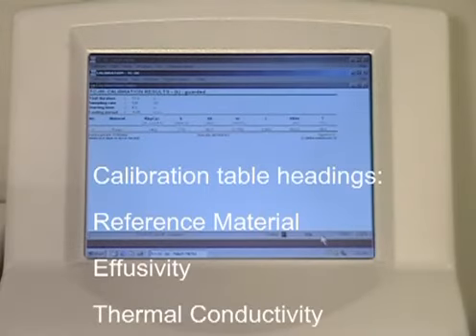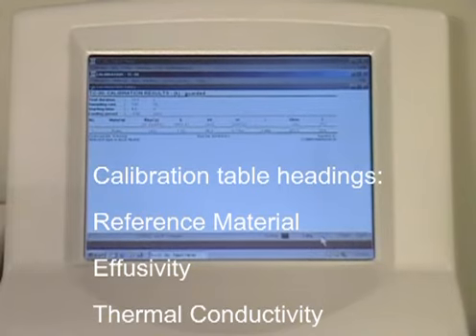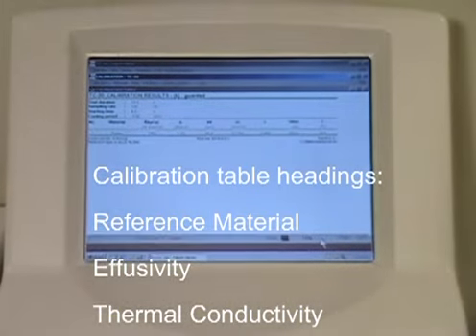The first three headings in the calibration table are Reference Material, Effusivity, and Thermal Conductivity. The Reference Material heading displays the name of the current reference material you are testing. The Effusivity and Thermal Conductivity headings display the value of that reference material.